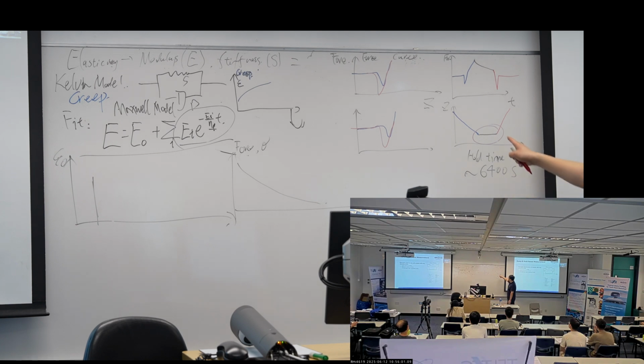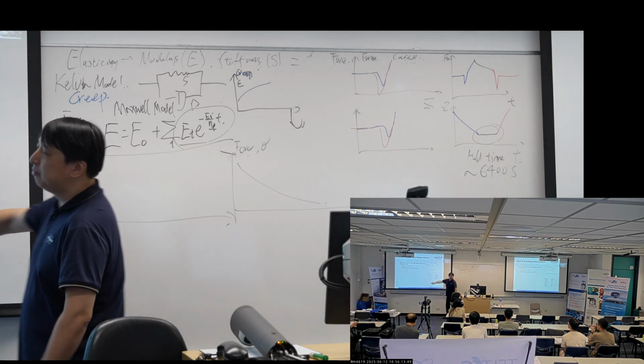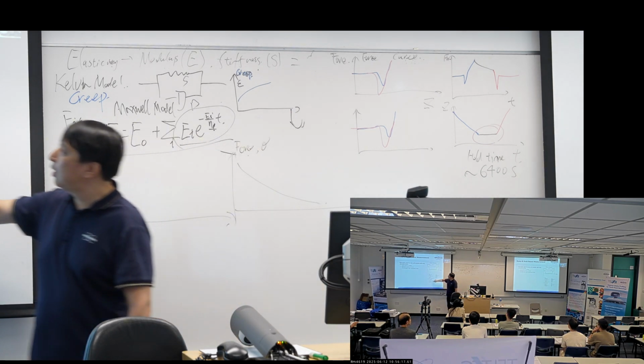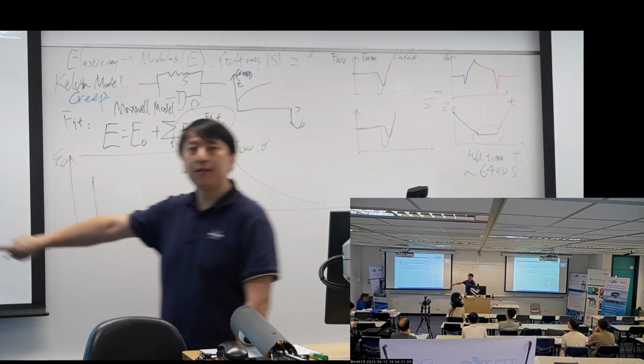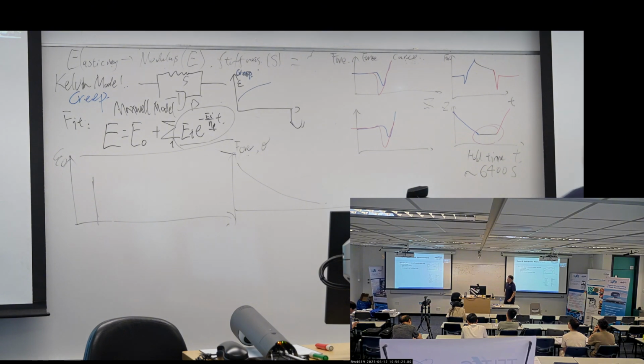So usually we want these hold samples to be as large as you can. Usually we give it about 1,000 or something. And the next thing, I'm sorry, the slide is wrong, and we need to figure it out in the afternoon. It is whether we need to hold Z or the Z sensor here. That's about a difference we need to show in the afternoon.